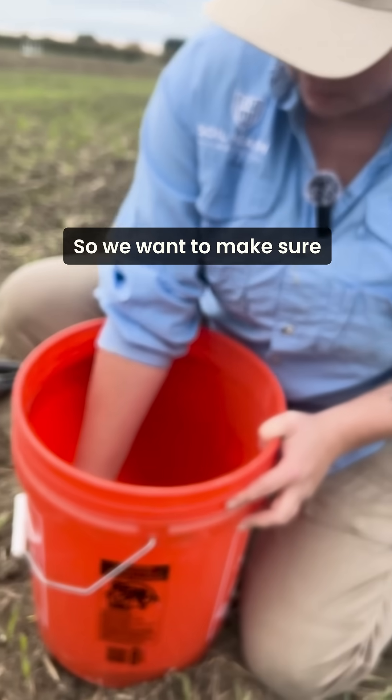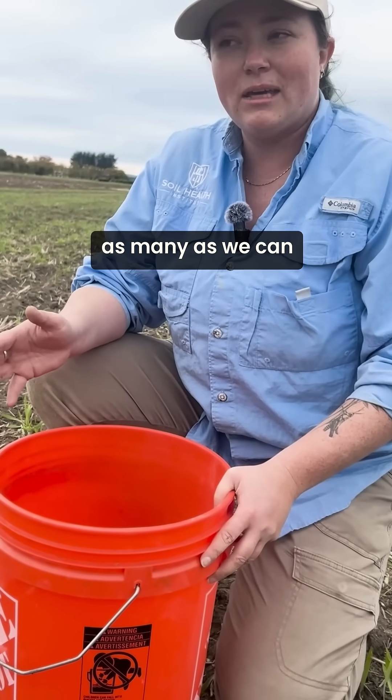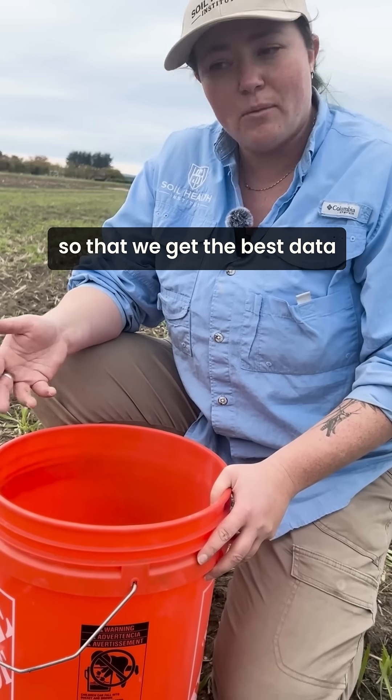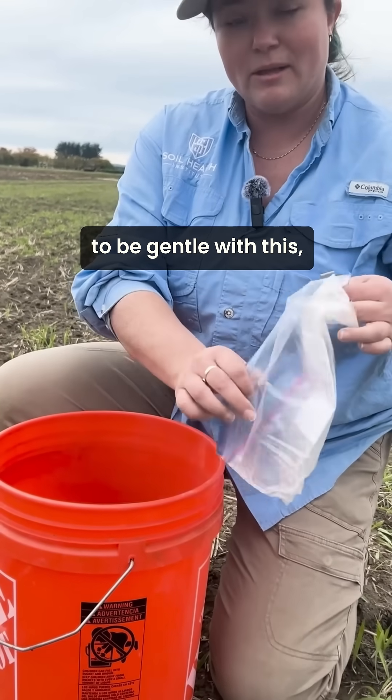We want to be pretty careful with these because aggregates can be really fragile. We want as many as possible to make it to the lab intact so that we get the best data we can, so we're going to try to be gentle with this.